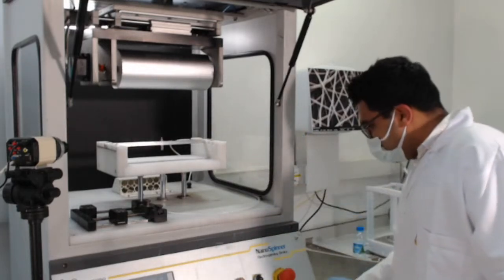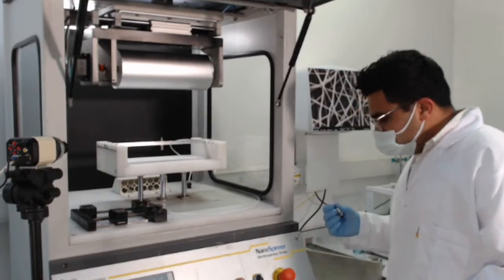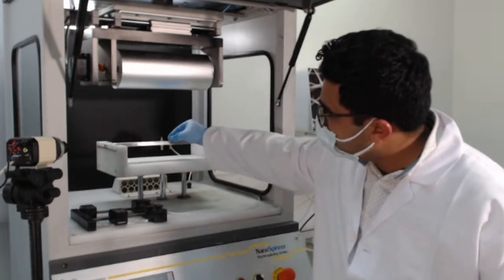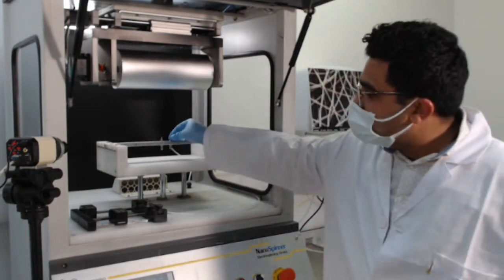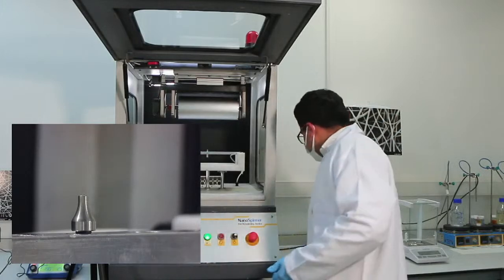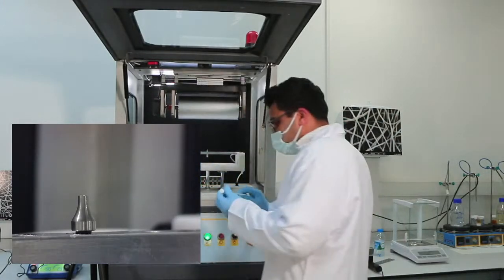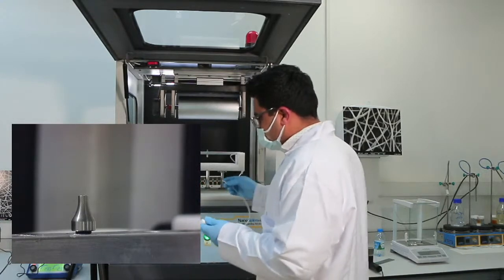Yeah, so I think that's most of it. You also have the standard needle that you can use for this machine. You can place it up here. It can work just as well. But let's just continue and set up the machine. Okay, so I'm going to use polyethylene tubing that's going to be connected to the syringe.